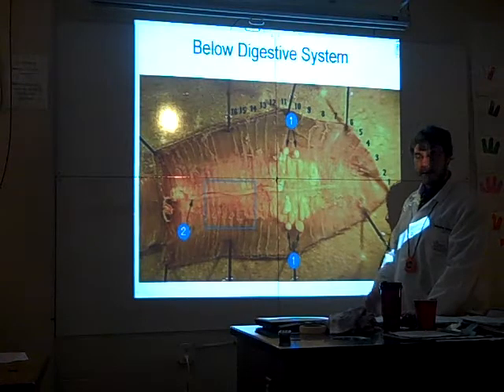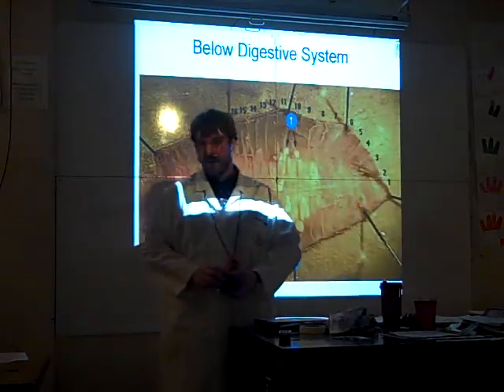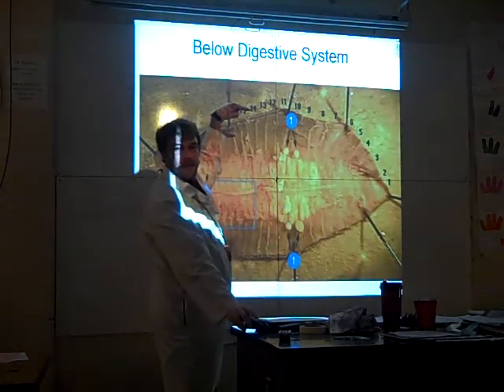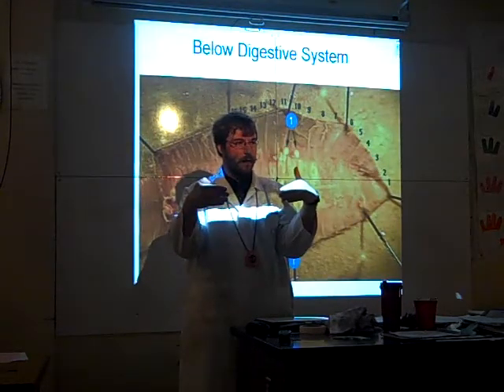It has multiple? They don't really have brains. They don't really have hearts. They have a pseudo-brain and a pseudo-heart. Questions? Fake heart. Right. Did you guys notice the pins? See how you don't see the pin heads? You need to stick them in at a really extreme angle.